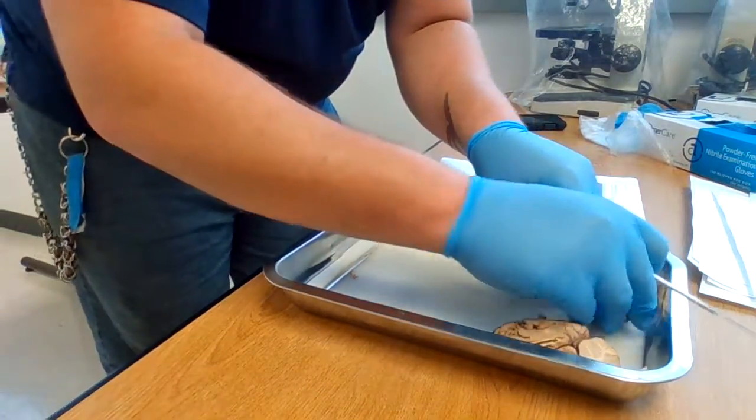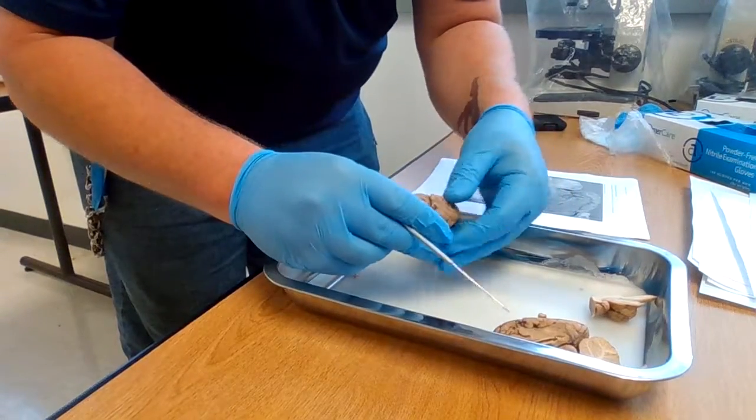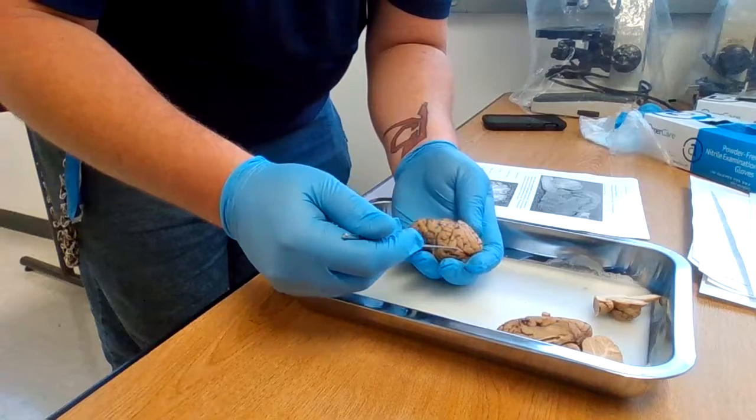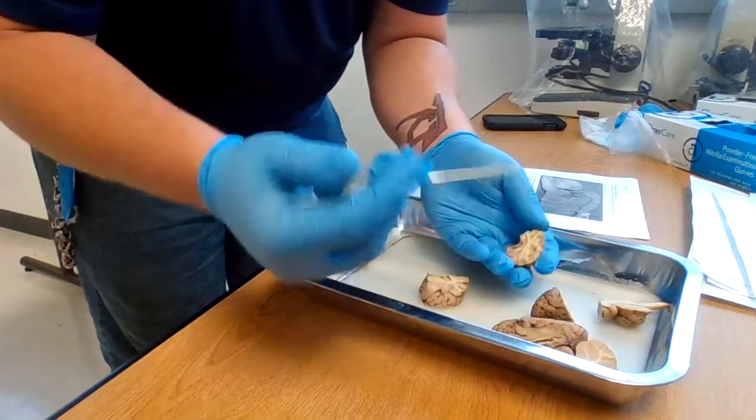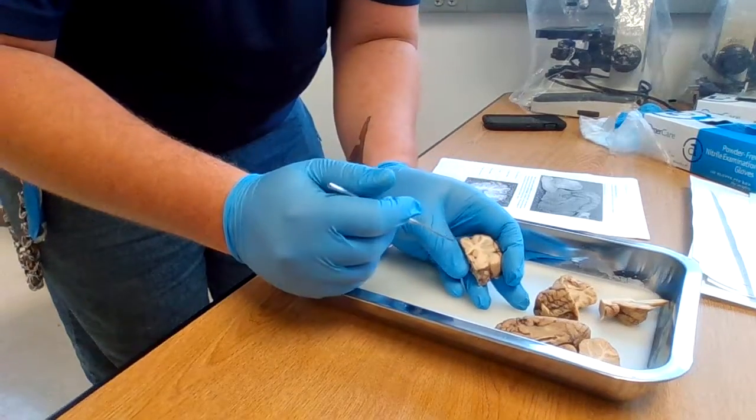We're going to cut again. We're going to cut the brain again in thirds. 1 and 2. This is going to be a better view.